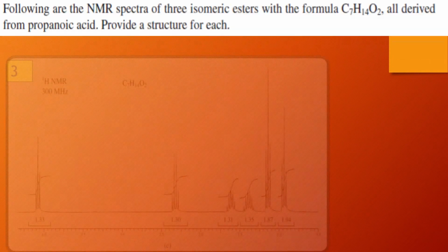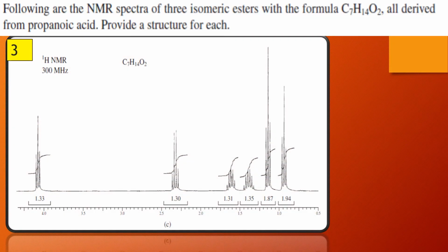So it is all. Yeah. So in this spectrum you can see there are a lot of signals, right? If there are more signals, it is quite easy to solve the spectrum. You can see the first peak is giving us a triplet, which means that there are 2 protons, right? So this is basically one possibility. Then we will move further.